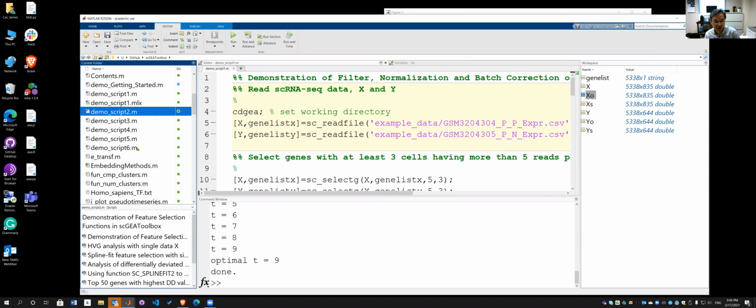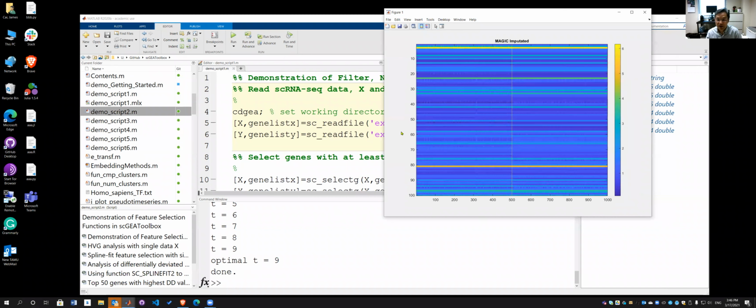You have 2, 3 to 6 for the demonstration, and you can play with them. If you have any problem, if you find any bugs, let me know. Maybe somewhere the code is not correct and you see the progress break up. Just give me a message. I will fix it.